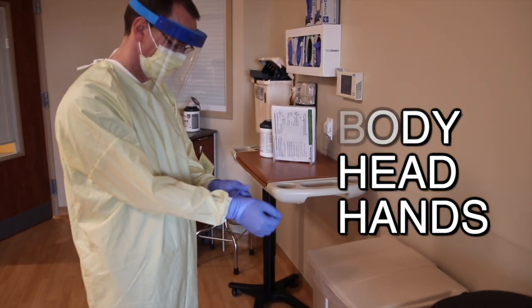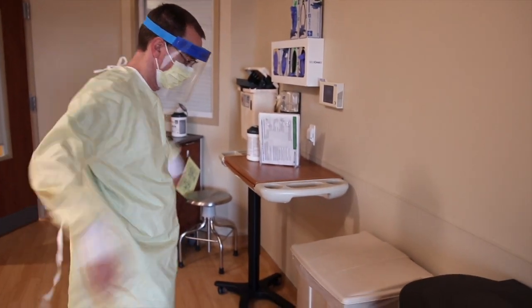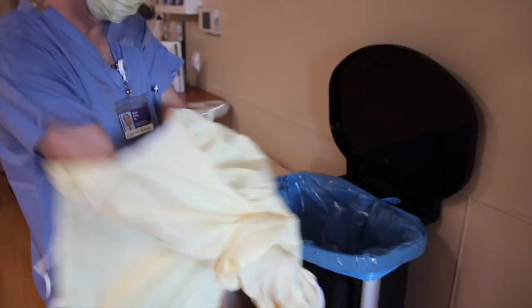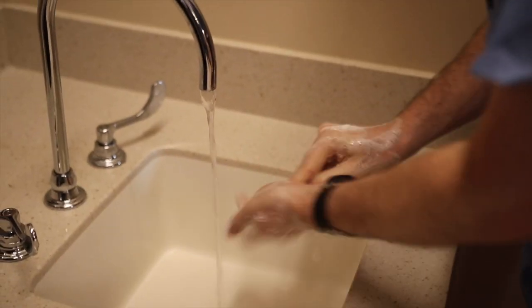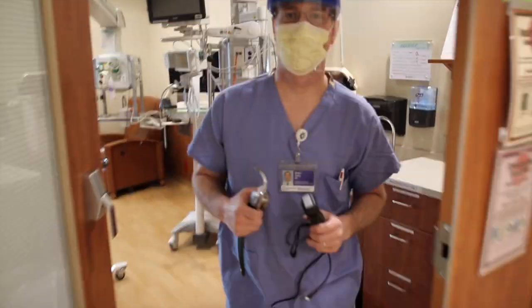If you are using a reusable gown, remove the gloves first, making sure to grab them from underneath, and then untie the gown and place it into the laundry bin inside the patient's room. Do not remove gowns or gloves outside of the patient's room. Wash or sanitize your hands inside the patient's room. You can then grab your clean equipment and exit the room.